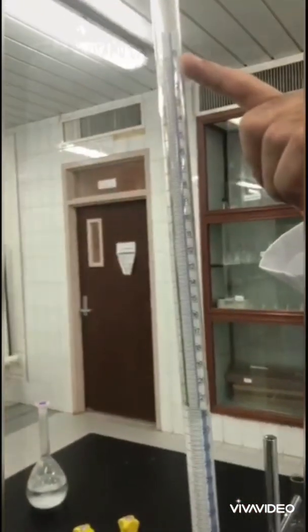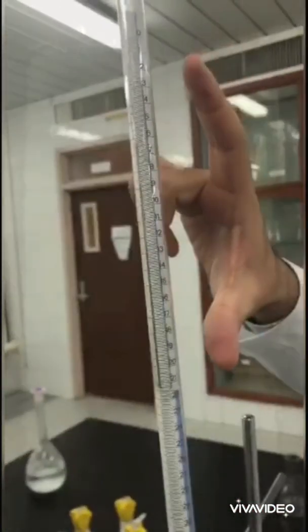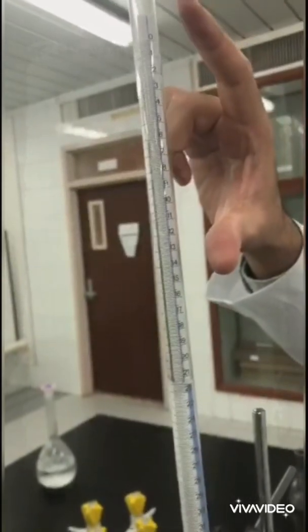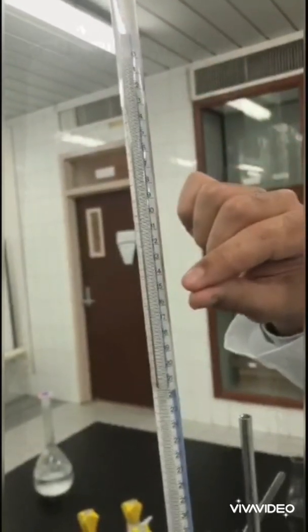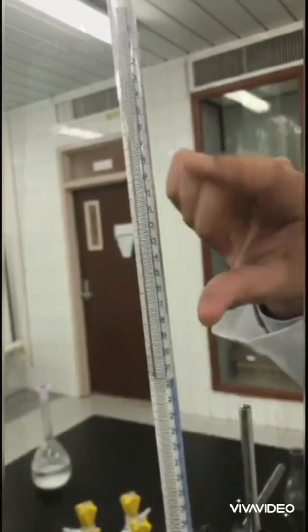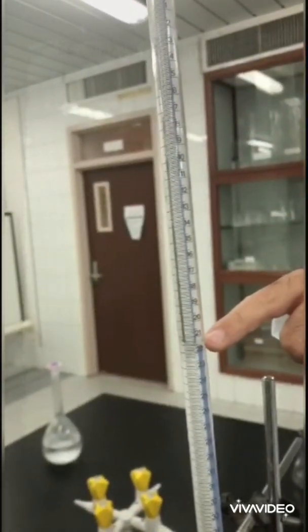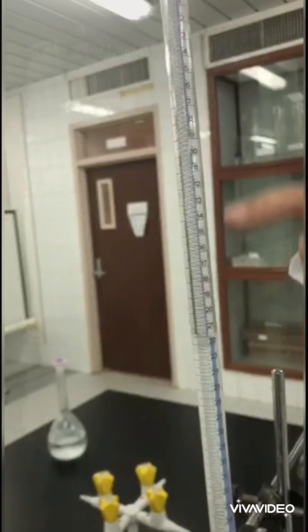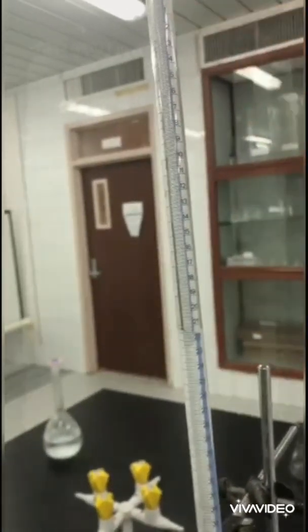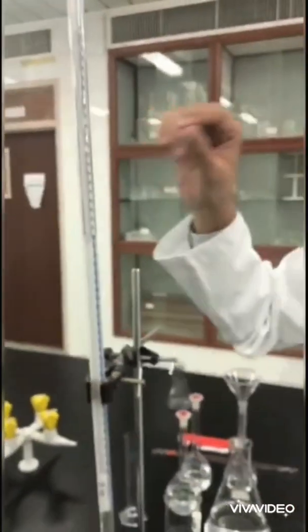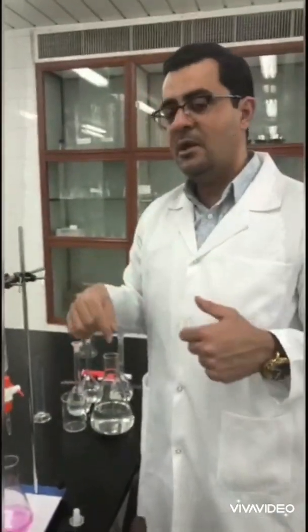It's 21.6 milliliters. This is the final volume while the initial volume was zero. Now we are concerned with the difference between them. We are concerned with the amount of sodium hydroxide used to neutralize the KHB acid. This amount is the difference between 21.6 and zero, which means 21.6 milliliters. This volume will be used in the next step in calculations.